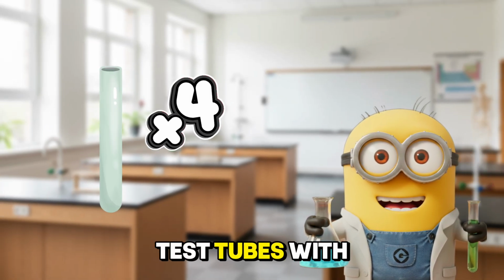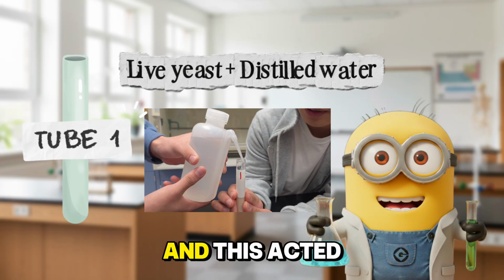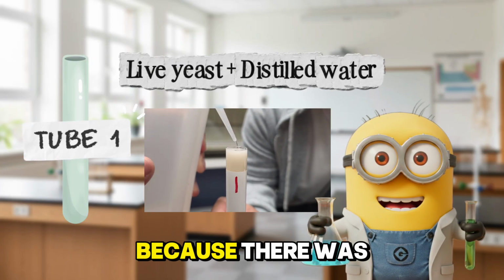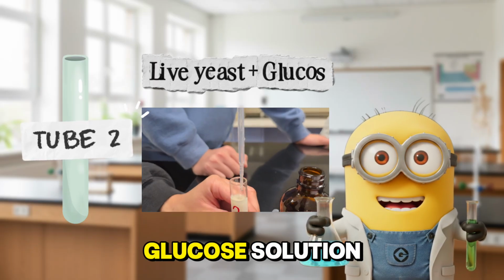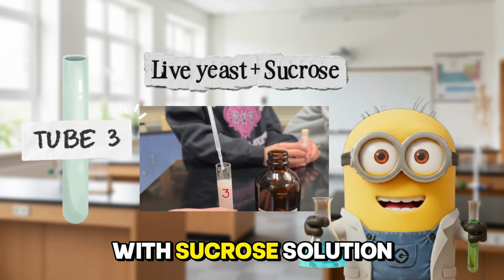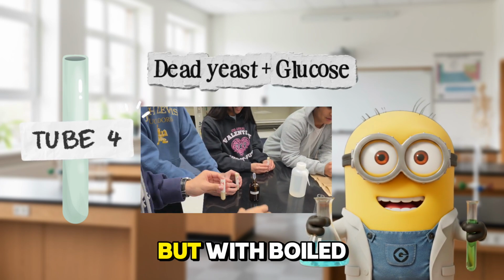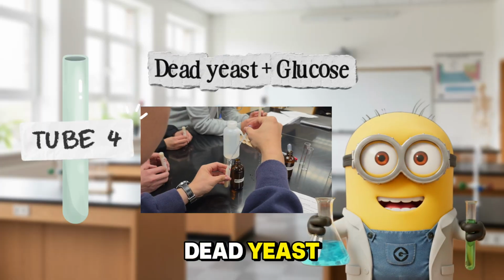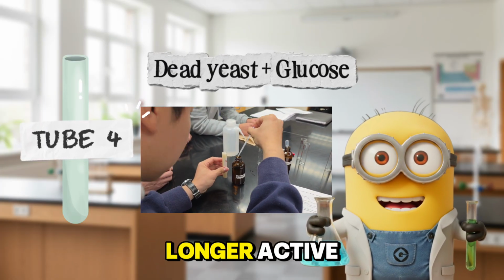We prepared four test tubes with yeast mixtures. Tube 1 had live yeast and distilled water, and this acted as a negative control, because there was no sugar for the yeast to ferment. Tube 2 had live yeast with glucose solution, our first test sugar. Tube 3 had live yeast with sucrose solution, our second test sugar. And Tube 4 had glucose added, but with boiled, also known as dead yeast, which served as another negative control, because the yeast enzymes were no longer active.